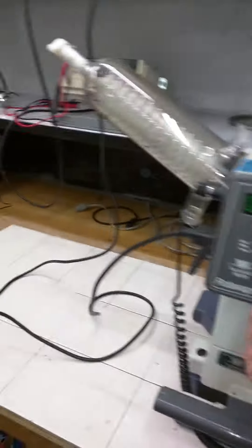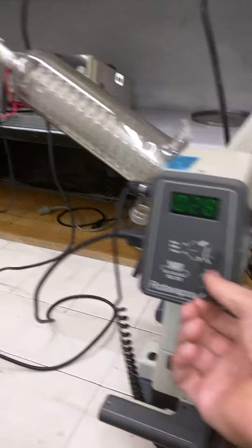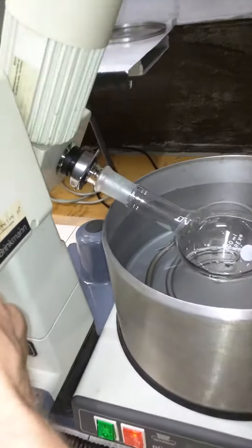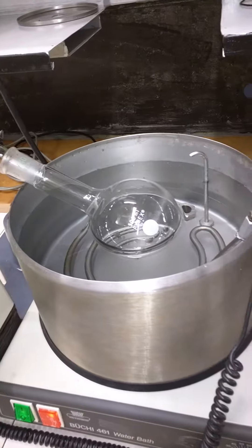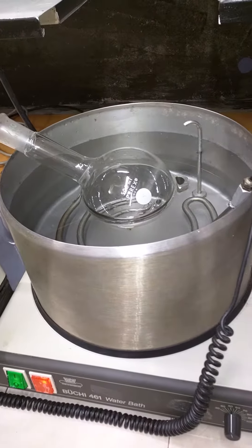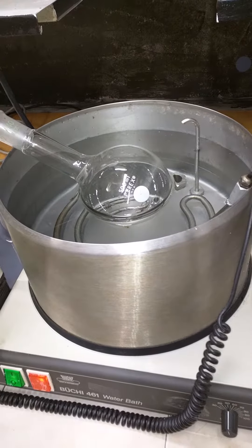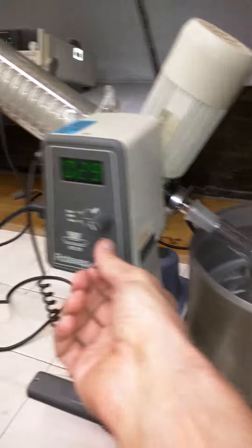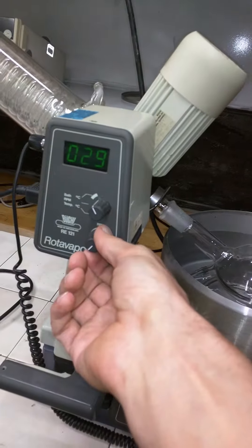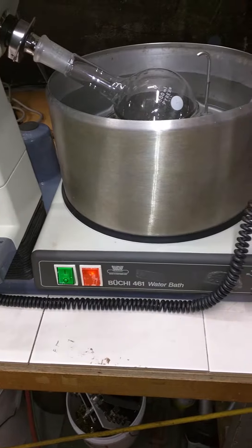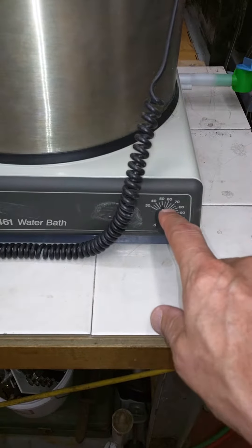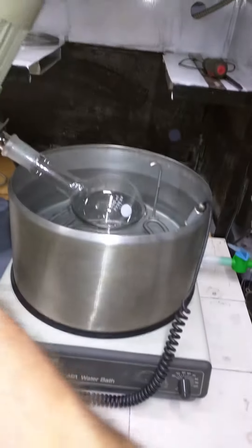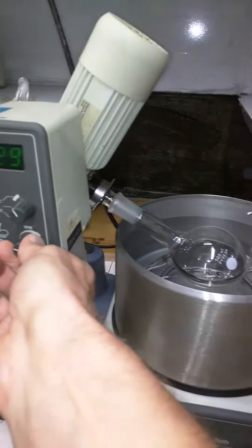It has a condenser, vapor duct, and sample flask connected. As you see, the temperature is already at 29, so it's getting in the water. Set the dial to 50 degrees Celsius and let's turn it on.